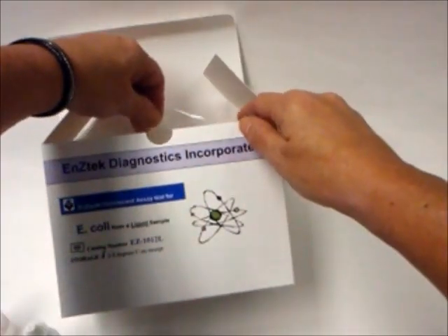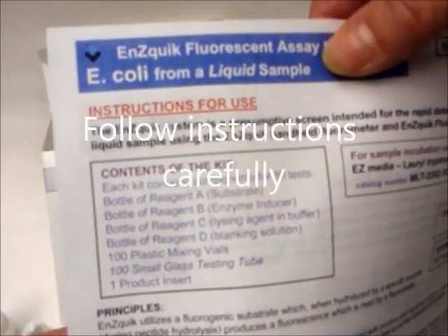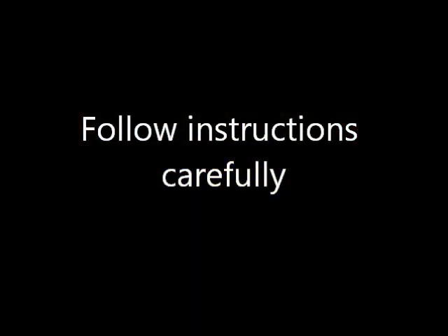Each kit contains the required reagents and testing vials. It is important to follow the instructions carefully, as any deviation could cause an invalid result. Always use proper techniques to avoid cross-contamination.